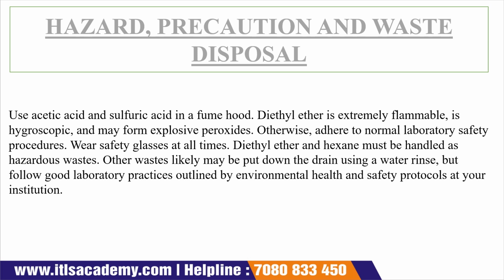Okay, now see what is written in the slide. Use acetic acid and sulfuric acid in a fume hood. Diethyl ether is extremely flammable, is hygroscopic, and may form explosive peroxide. Otherwise, adhere to normal laboratory procedure.